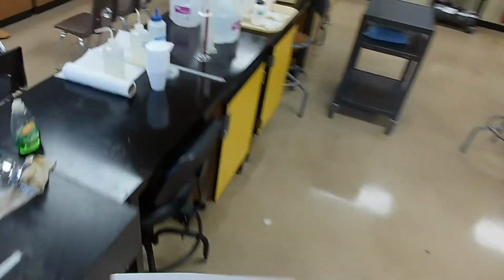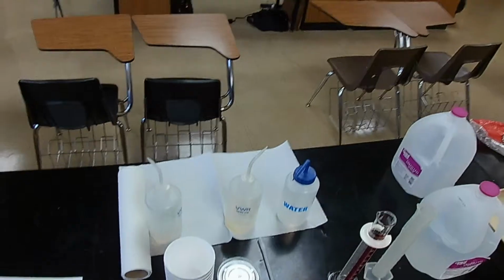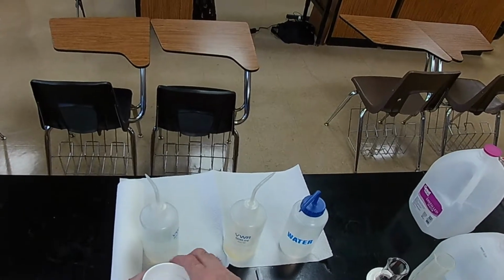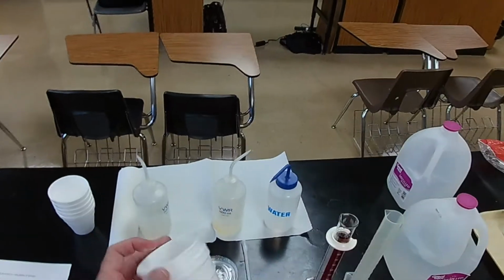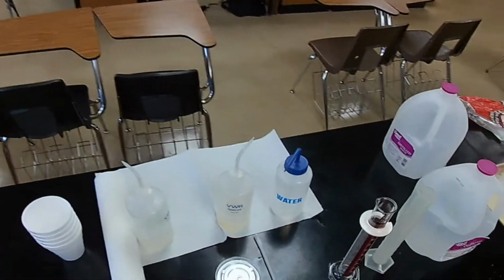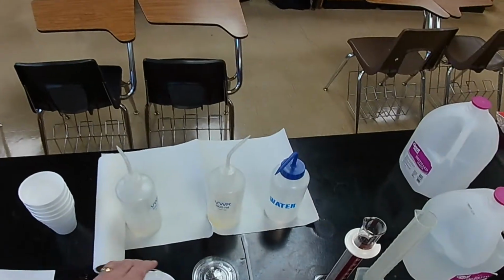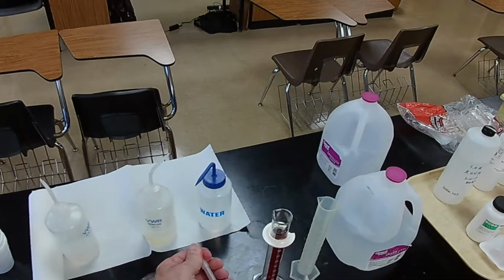First, we have to get the calorimeter constant. And to do that, all we need is first to construct the calorimeter. And the calorimeter is a very simple device. It's an insulated system. We have 2 styrofoam cups with a lid and a thermometer.